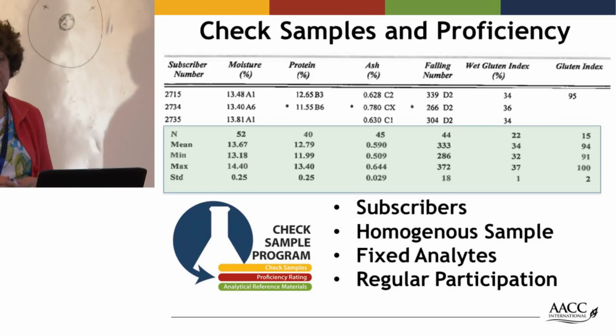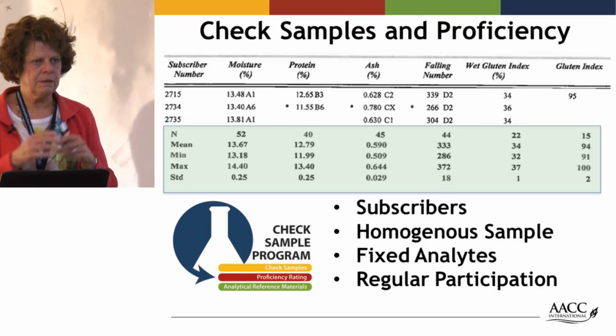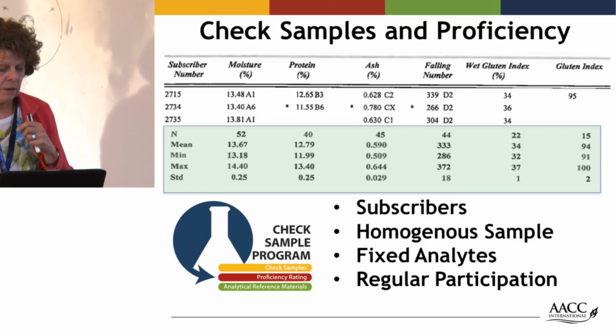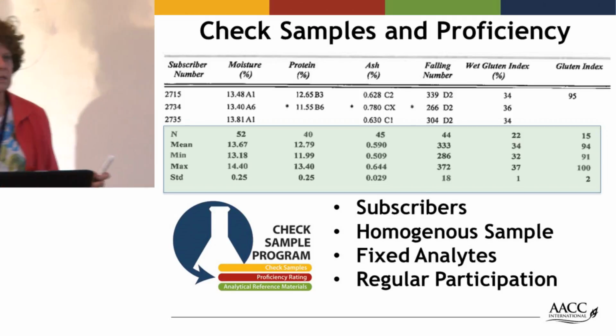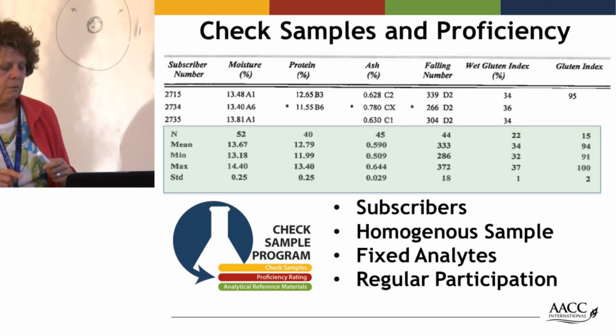Maybe your instrument is calibrated incorrectly. Maybe the analyst who does it doesn't leave the time period long enough. There could be any number of reasons. And it is important to work around it. And because it's an ongoing thing, you can actually see if an instrument is trending, because you're starting to fall away.